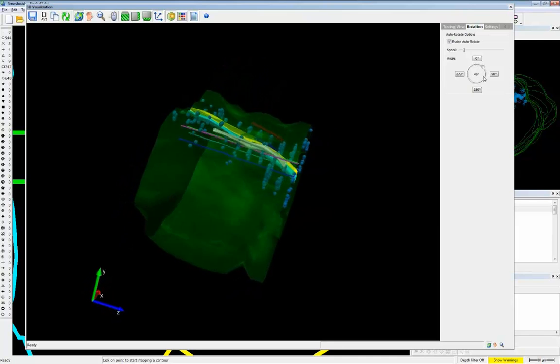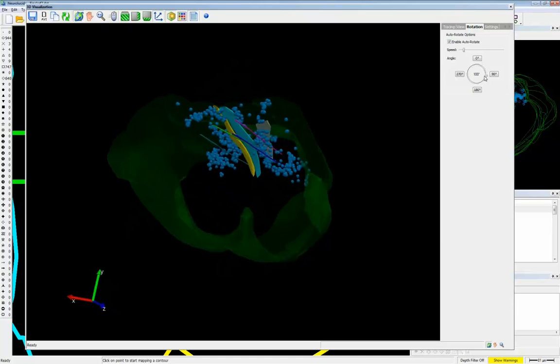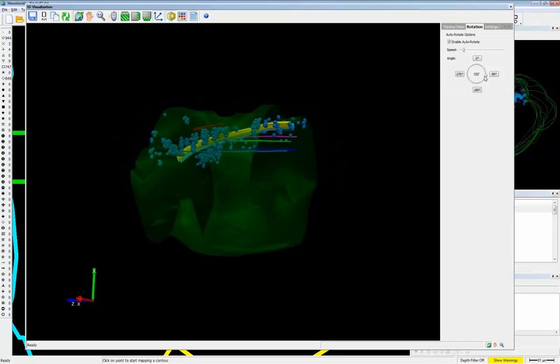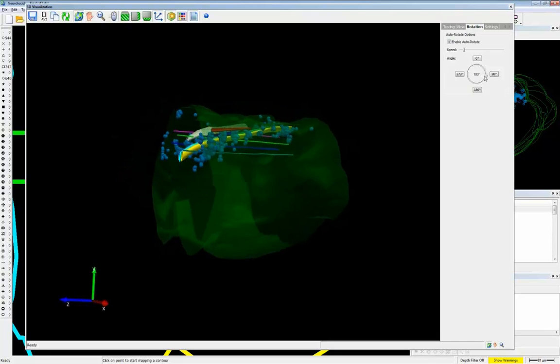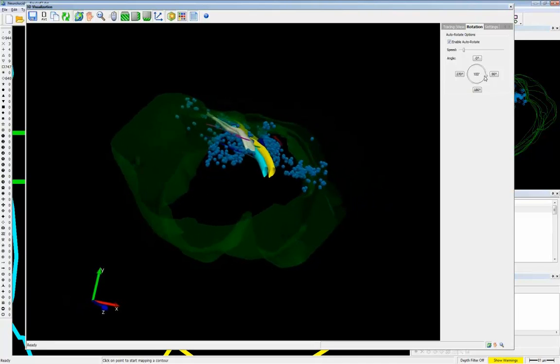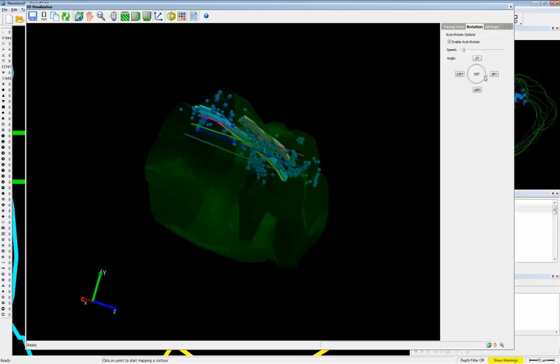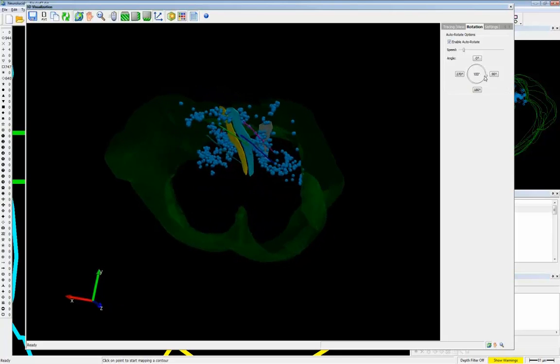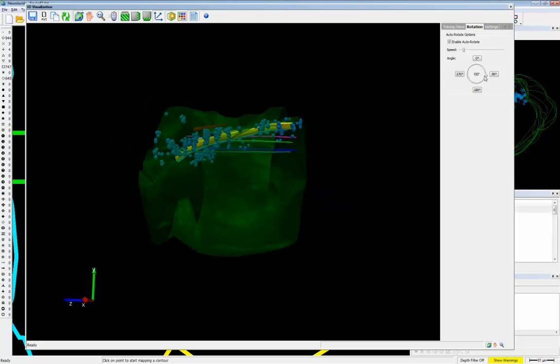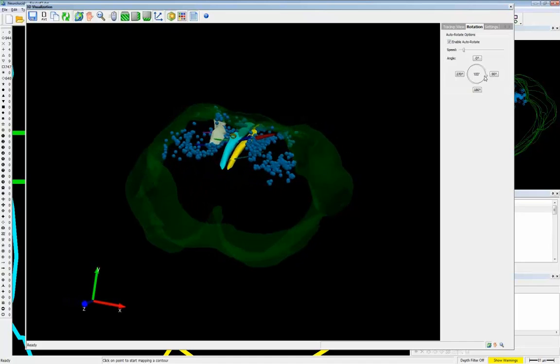So really this takes all your work that you've done up to now and puts it into a nutshell that you can get your take-home. I like that auto-rotate because I know that I'm not very smooth when I use the mouse, and if I wanted to create a movie, it would just be too jerky, and I'm not willing to cut down on my caffeine intake, so I like that feature. So that's the 3D visualization in a nutshell.